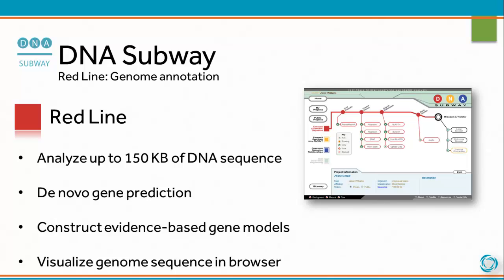The DNA Subway Redline is devoted to genome annotation. On the Redline, you can analyze up to 150 kilobases of DNA sequence, use de novo gene prediction algorithms, construct evidence-based gene models, and visualize genome sequence in browsers.